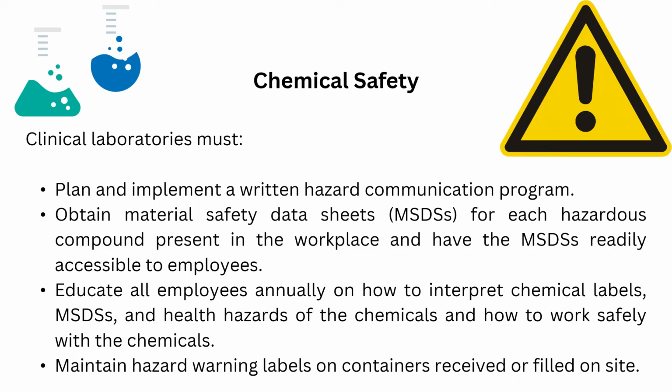Educate all employees annually on how to interpret chemical labels, safety data sheets, and health hazards of the chemicals, and how to work safely with the chemicals. Also, maintain hazard warning labels on containers received or filled on site.